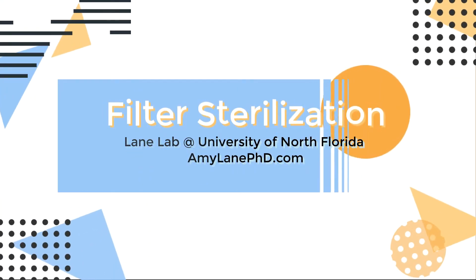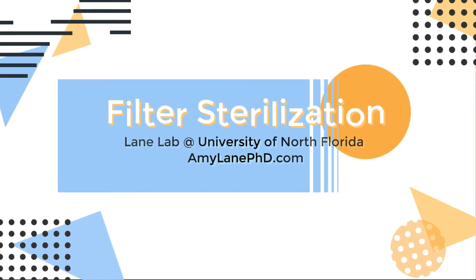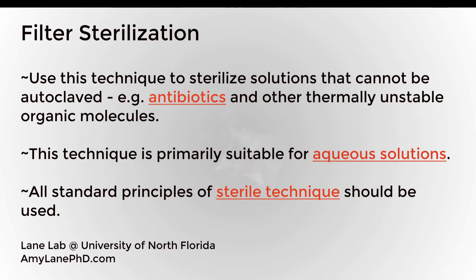In this video, we discuss the technique of filter sterilization, and we will go through step by step how to filter sterilize an aqueous solution. You will use filter sterilization to sterilize solutions that can't be subjected to heat via autoclave. For example, antibiotics and other thermally unstable organic molecules that are in an aqueous solution are suitable for filter sterilization using the techniques we talk about here.